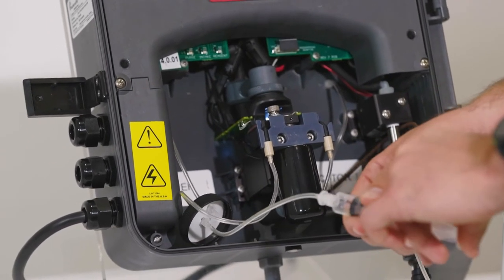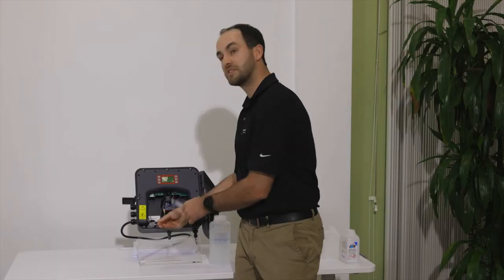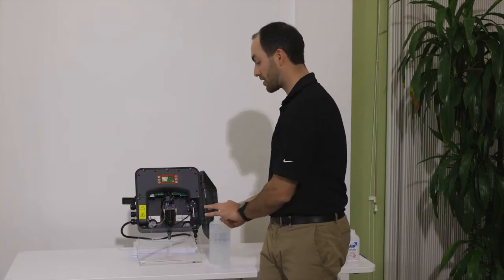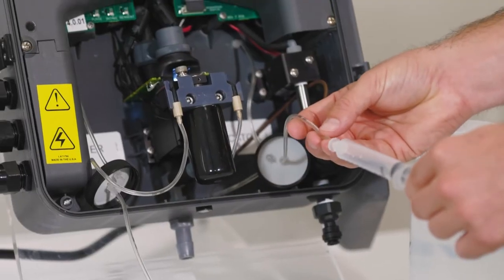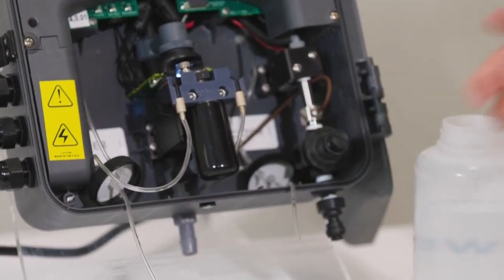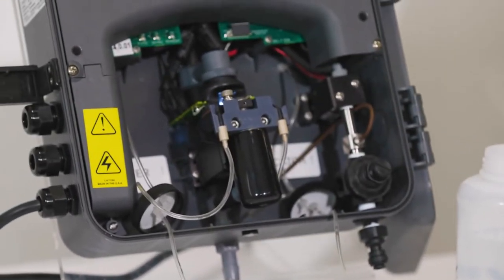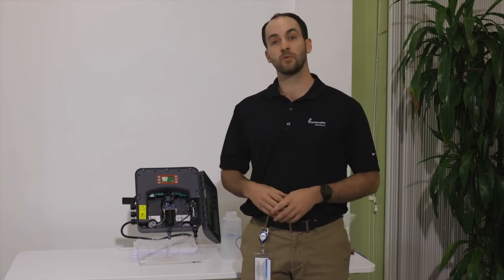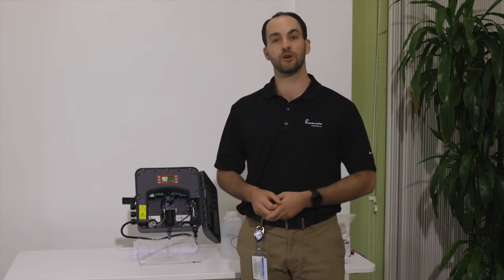Once we flush 10 milliliters of DI water through we will do the same thing on the other side. DI water into the syringe, lure lock into the end and we will go ahead and push the DI water through on both sides. So after we flush the lines we are ready to go ahead and mix our new reagents.